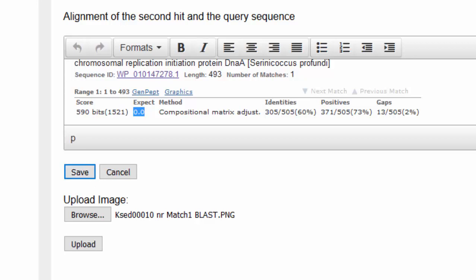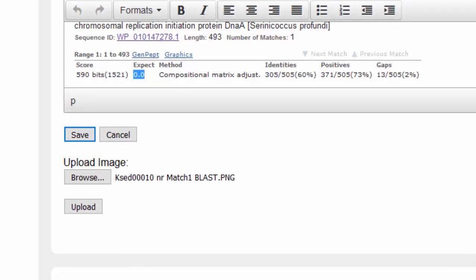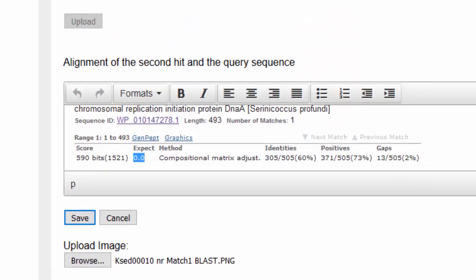And that brings us to the end of the blast sequence. You're going to run these a couple times. So we took our time to make sure we did this example right. There is an additional sheet if you have trouble and you run your Clostridium gene and find that all your results are Clostridium. So check out that thing in the files if that happens to you. And there's basically a simple checkbox to exclude Clostridium so you don't have to sort through a lot of stuff.